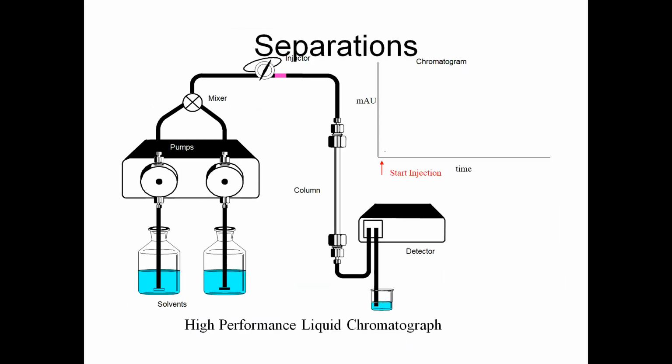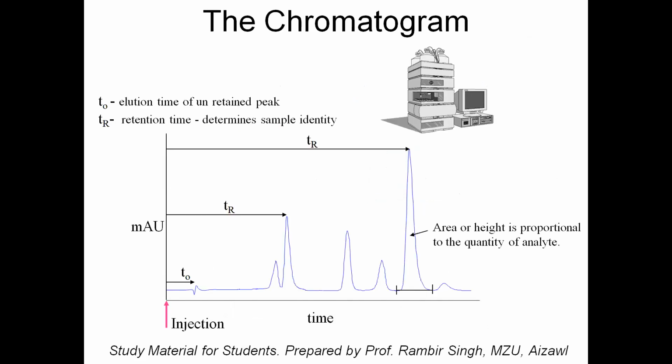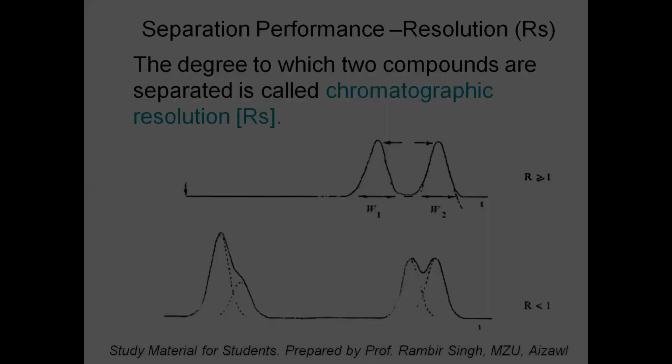I am here. You have seen this, I think you understood this part, HPLC and everything. What is a chromatogram? The map that shows the peak, the concentration. Okay, so you write down the definition: a developed chromatographic plate is called a chromatogram.